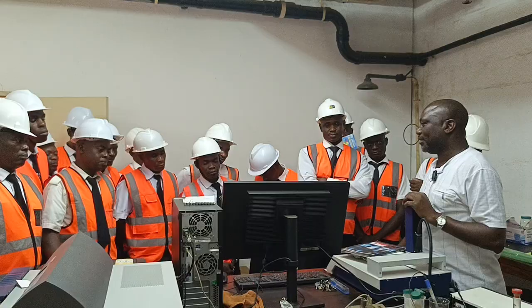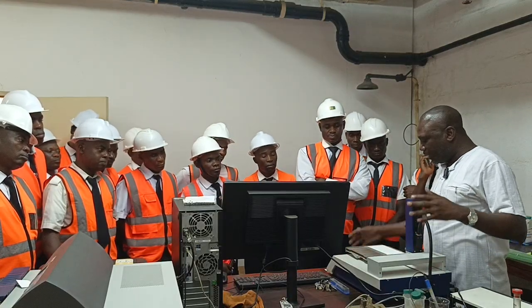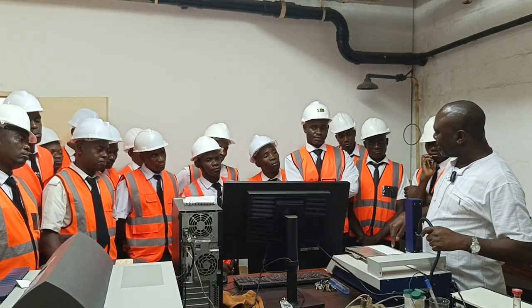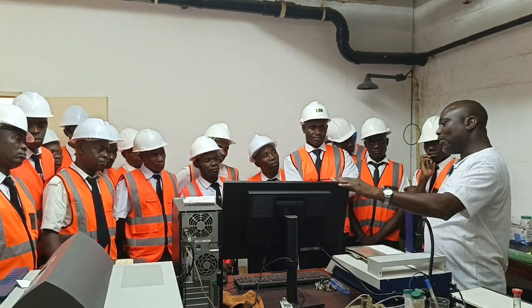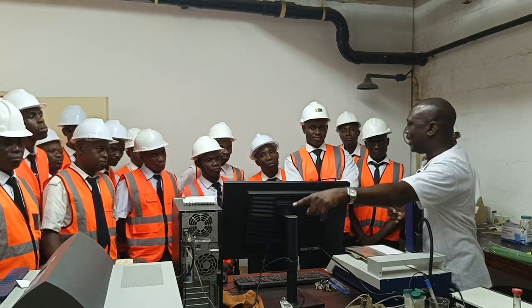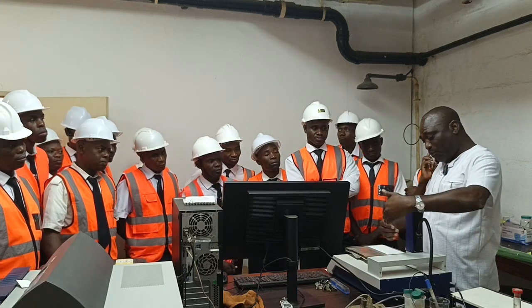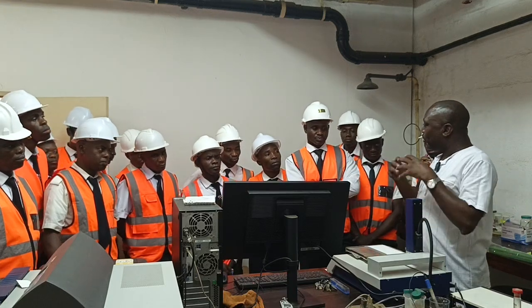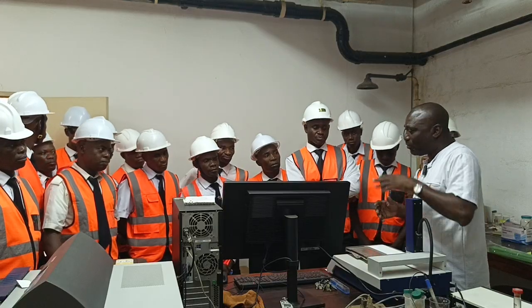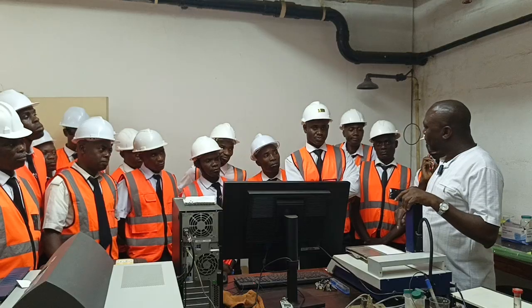So this part of the machine is only used for application of the sample, putting the sample on the plate. And this is just a normal computer with the software that controls this, and even that. So you yourself have to tell how much you should apply here, and what you are looking for. You have to tell the machine, I'm looking for TNT in this sample.